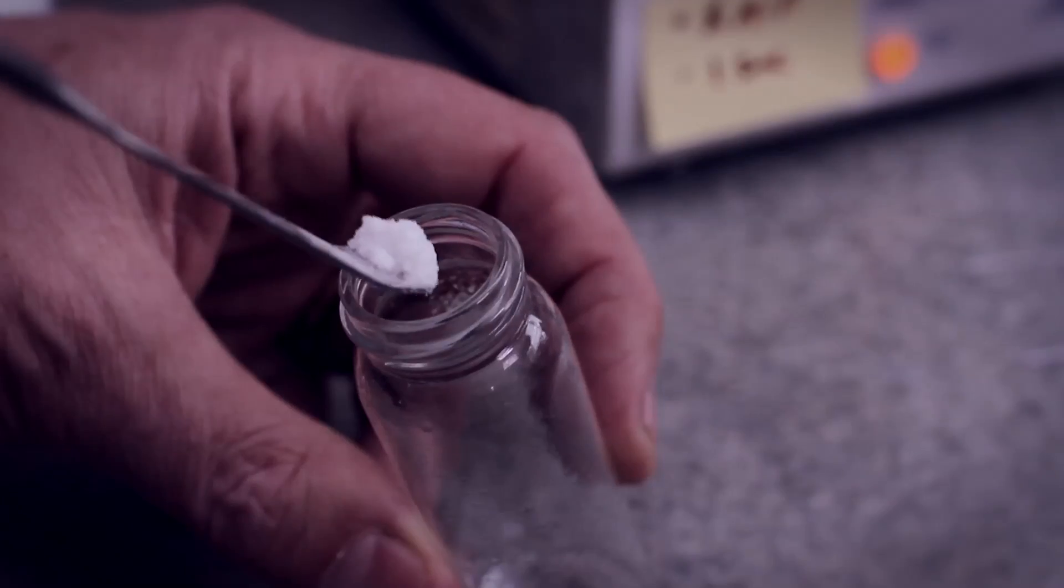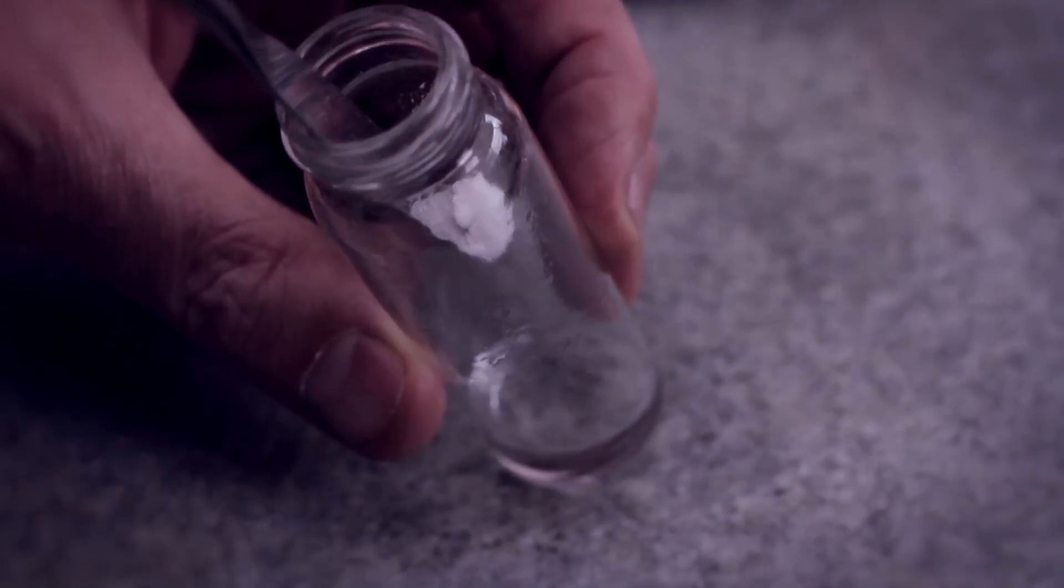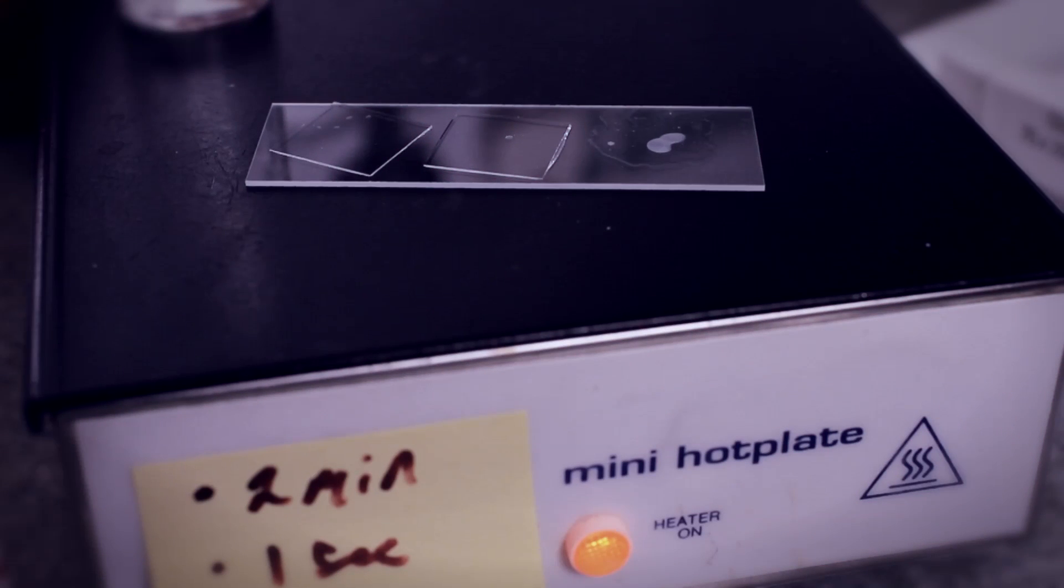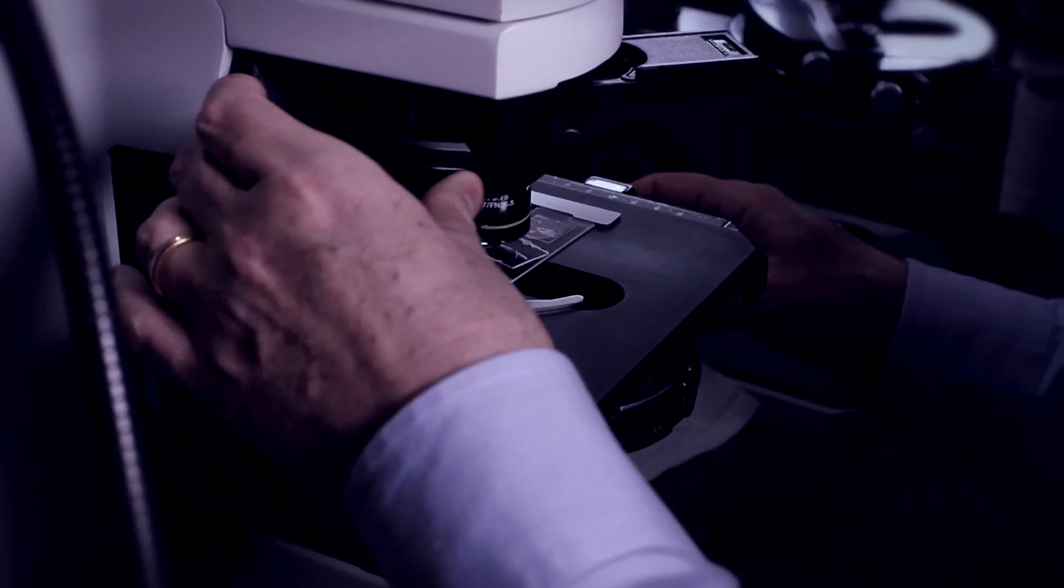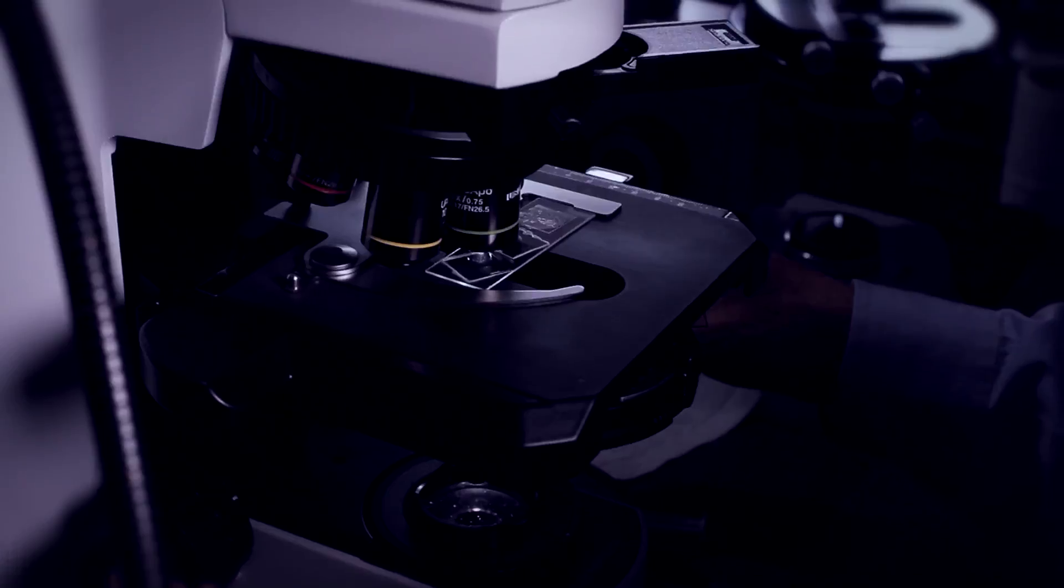Now vitamin C is a colorless white powder, but if you dissolve it in water and then crystallize it under a polarizing light microscope, the colors and forms that you see are spectacular.